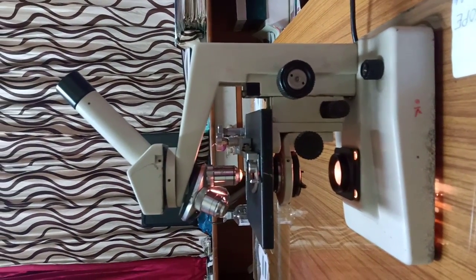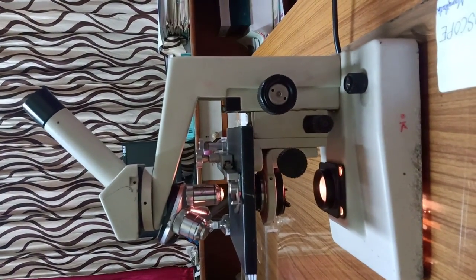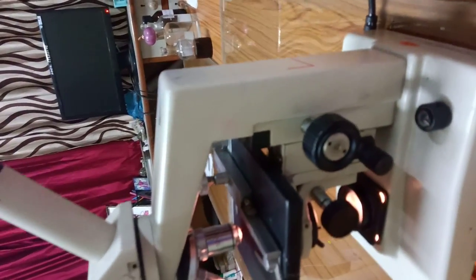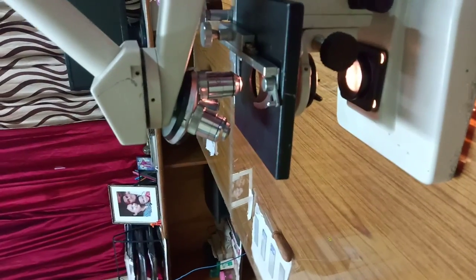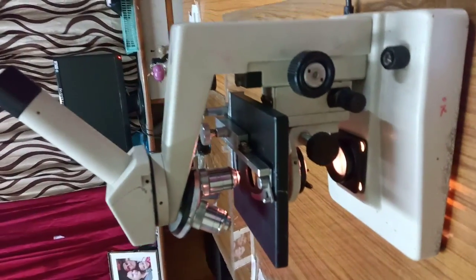A typical compound microscope consists of strong metal body or stand composed of a base and an arm to which the remaining parts are attached. Talking about the parts of a microscope, students, let us understand the different parts of a microscope.